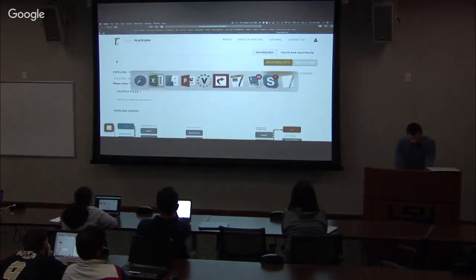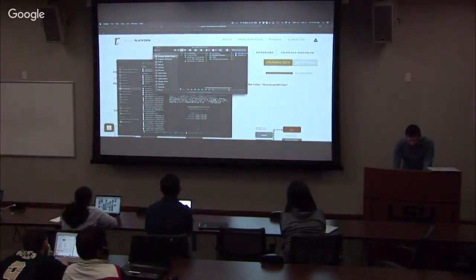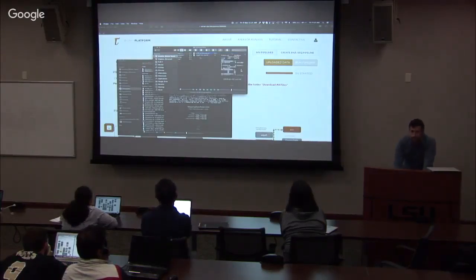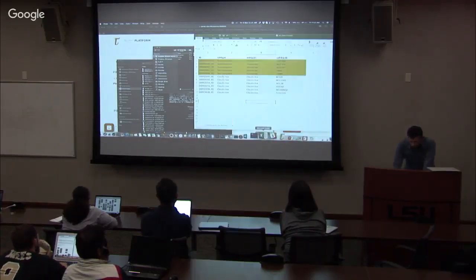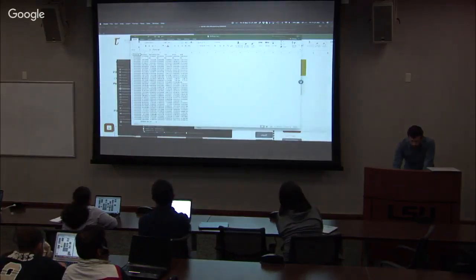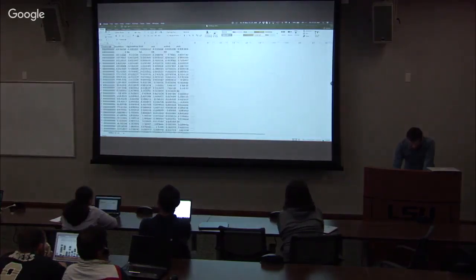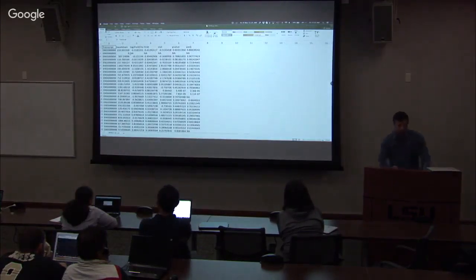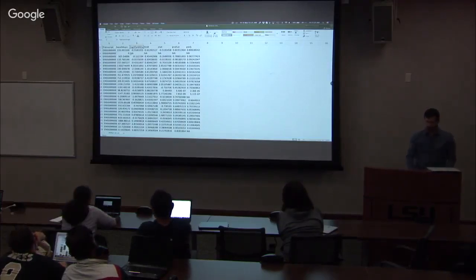So we're not going to wait for this to finish, but you do have in your output files, right here under output files, you have differential expression. And here you have the output from DESeq2 and from edgeR. So let's take a look at DESeq2. Okay, so here's what we have here. We have log2 of fold change.